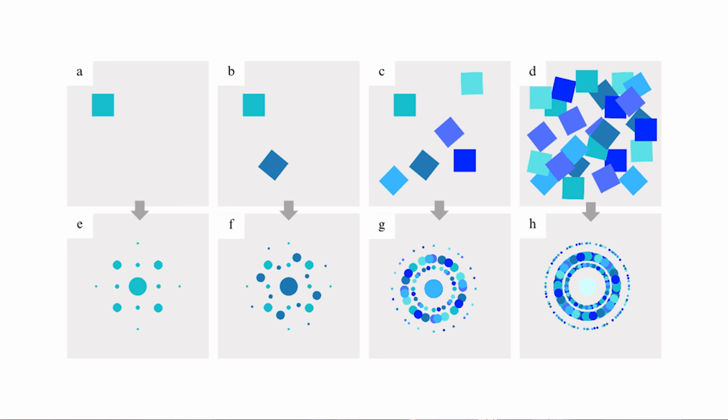If we have more crystals, the spots start to be arranged in rings, and if we have a powder electron diffraction pattern, so powder, many monocrystalline, nanocrystalline material in the sample, then we have the diffraction ring.